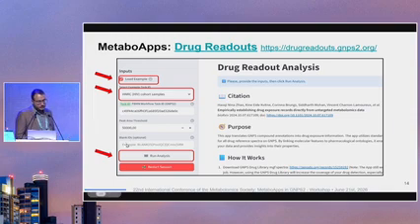And then you can also directly remove the information for blanks, blank samples, internal standards, pooled or QC samples, and even SRMs, so standard reference materials. But you can do that even if you're applying a different code for that sample. You just type in whatever code you used for that sample in this space here.